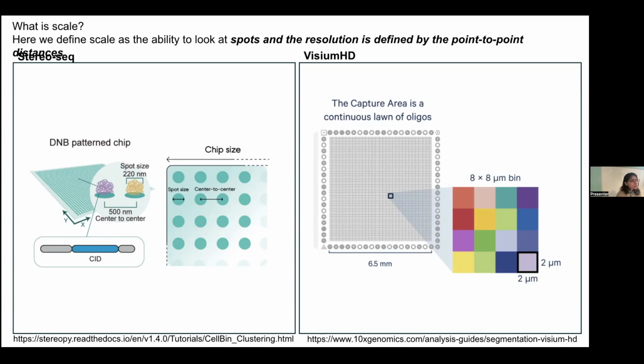Now, when it comes to scale, this isn't exactly to scale, I guess, but I'm going to talk about dead space. Who likes dead space? It means that you're missing something. But if you're doing something like profiling, you're not really interested in minute reductionist questions like cell-cell communication or interaction properties. Does it matter?